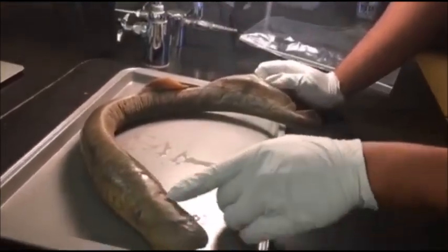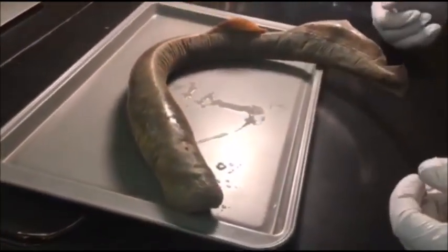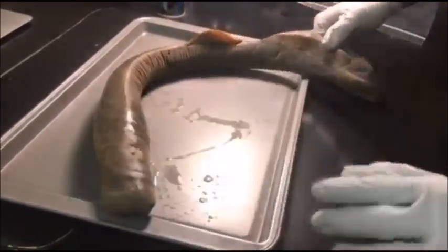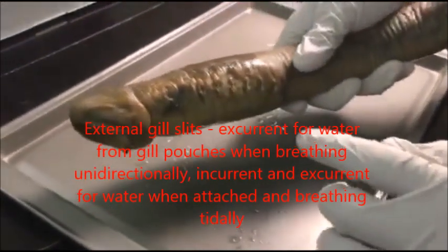There's the nostril right here, which basically serves the same purpose as in humans. And then he has 14 gill slits total, so 7 on each side.